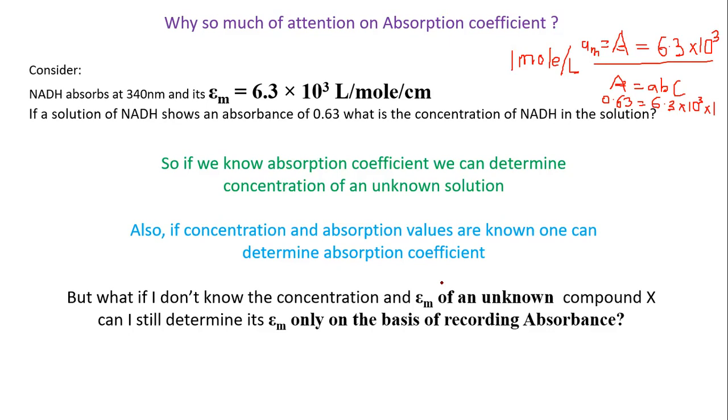Now, imagine that you don't know the concentration. Let me give you a situation: you have an unknown compound X with you. The compound is not known, but you know that it absorbs well at a particular wavelength value.